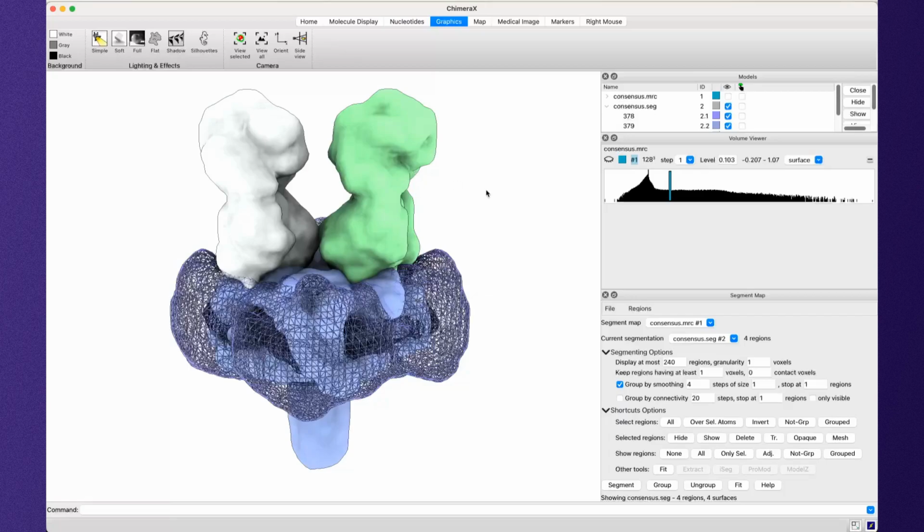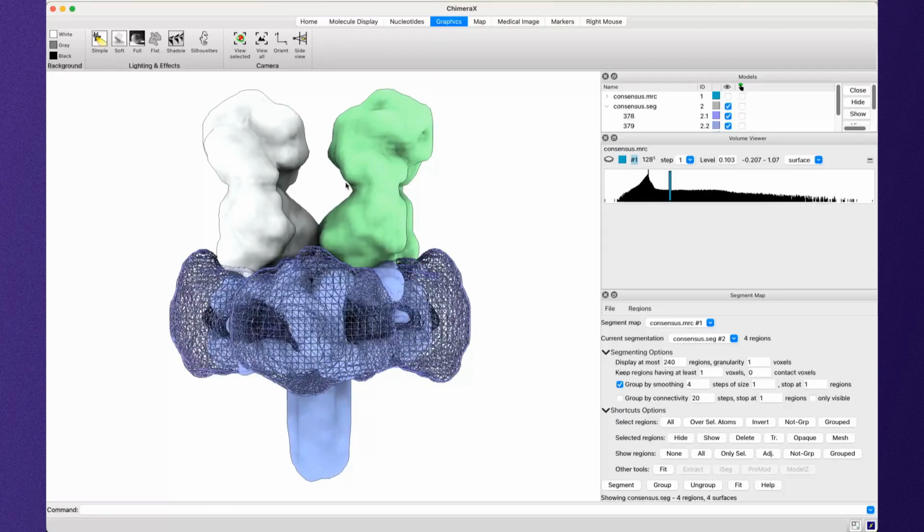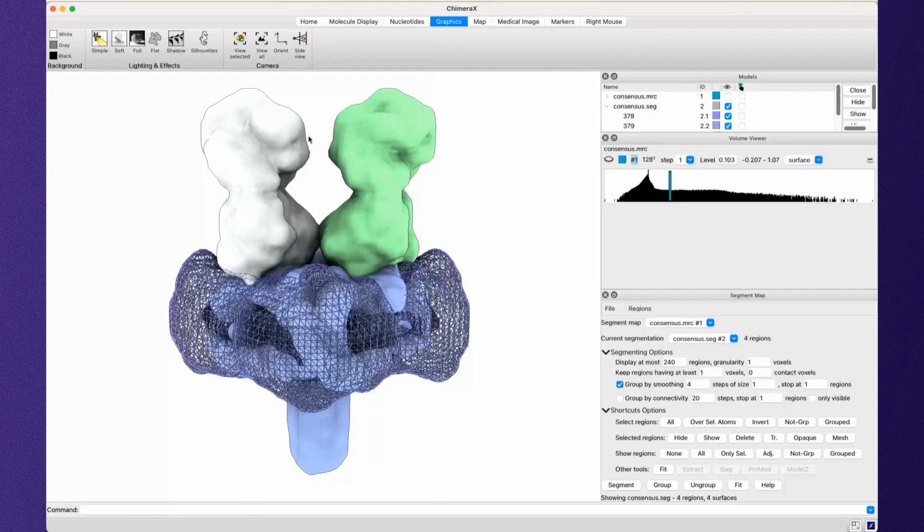And also, it can cause some problems if the segments are especially small. So generally, we would recommend that you create the segmentation segments that we'll upload to create the mesh to make them as big as possible while still retaining the relevant relative motions. So for instance, even though we could make this fab thing into one segment, that would defeat the purpose because now these tetrahedra would be fused to each other.